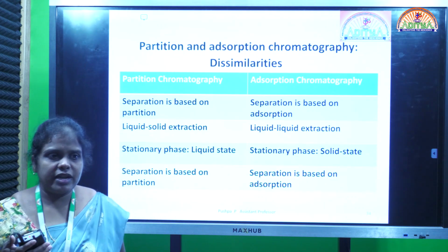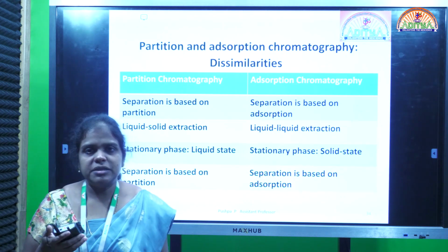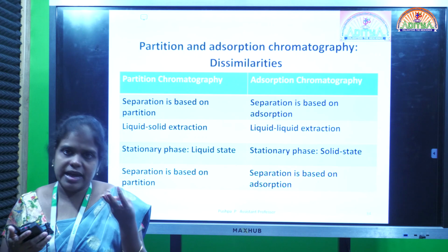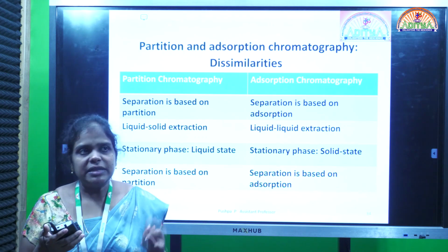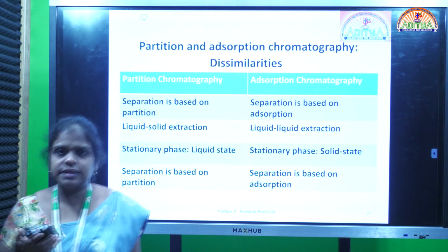If the sample, for example, I am going to separate the paracetamol drug. That means in the paracetamol drug there will be the pure paracetamol component and some other excipients like binding agents, lubricating agents, coloring agents, preservatives.